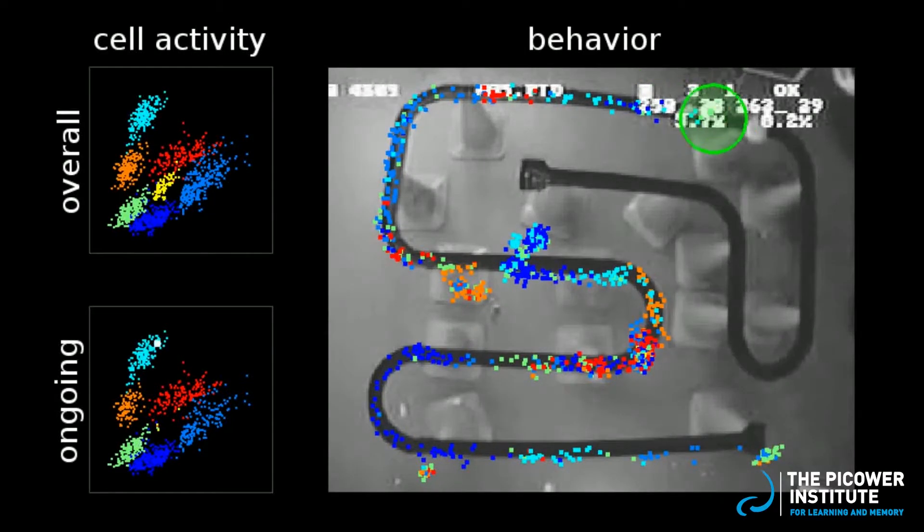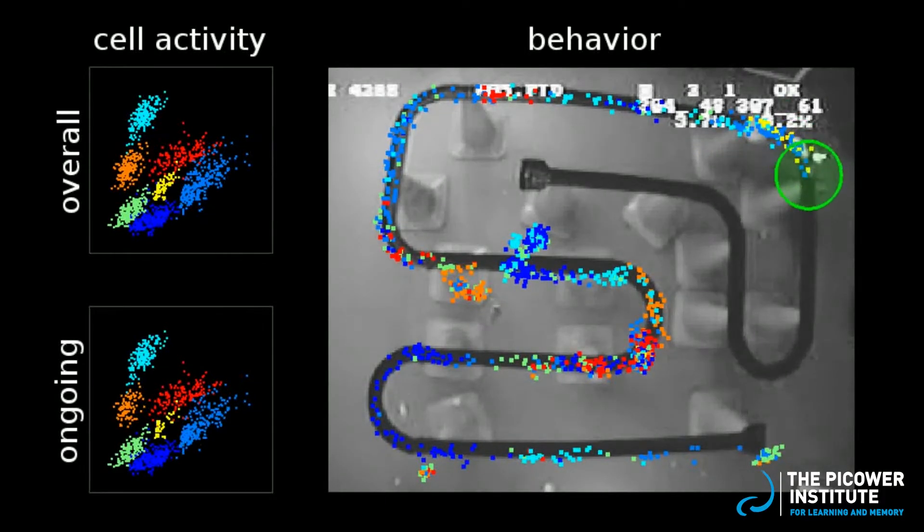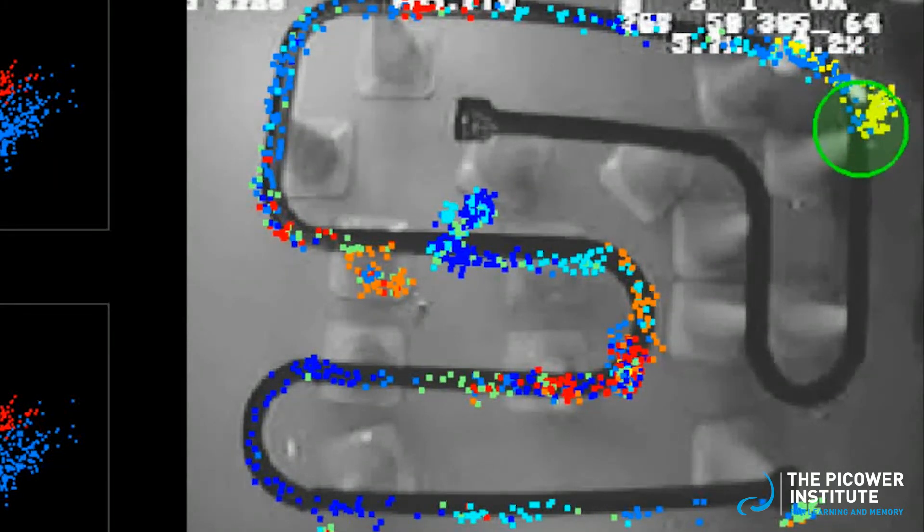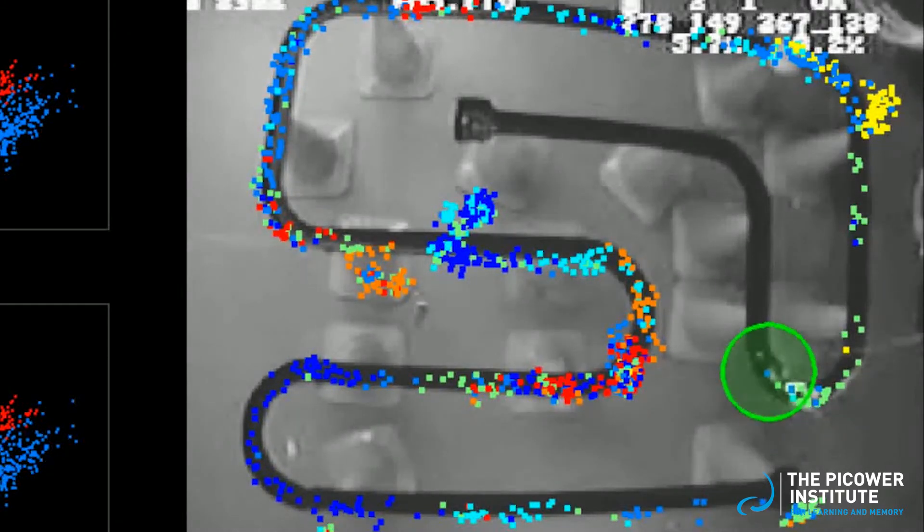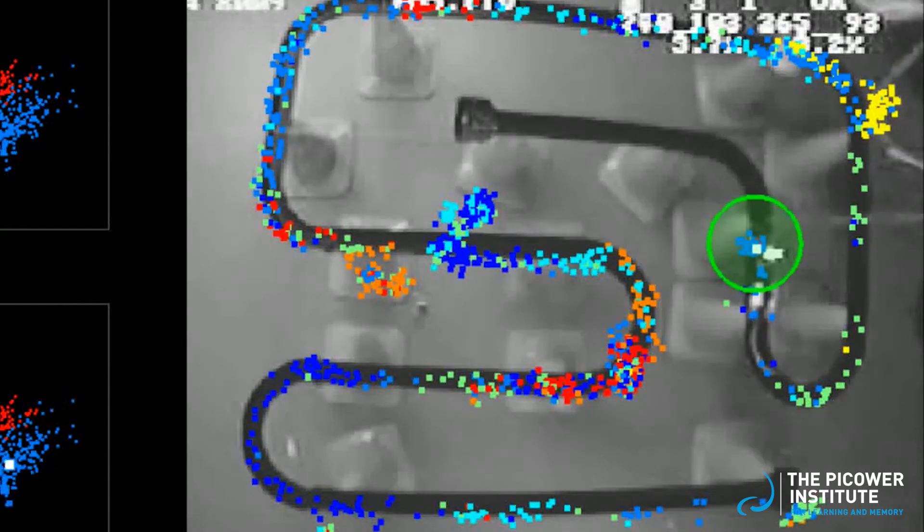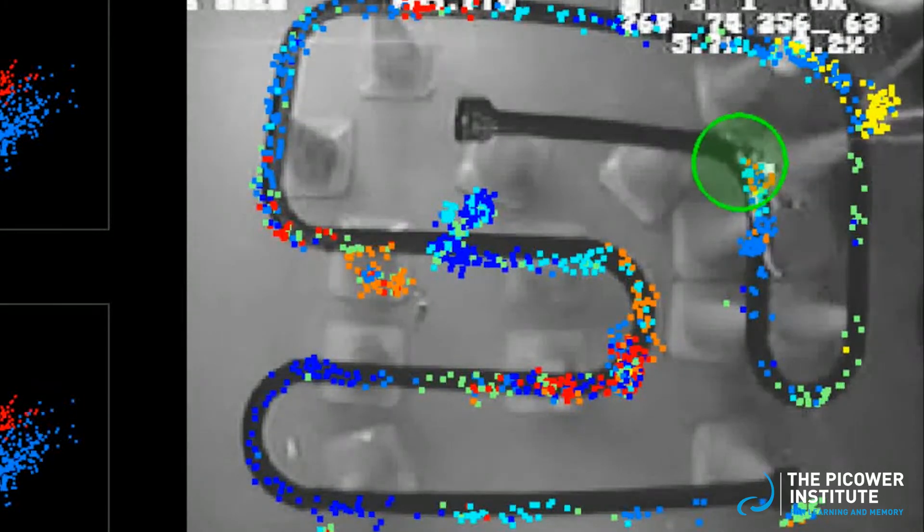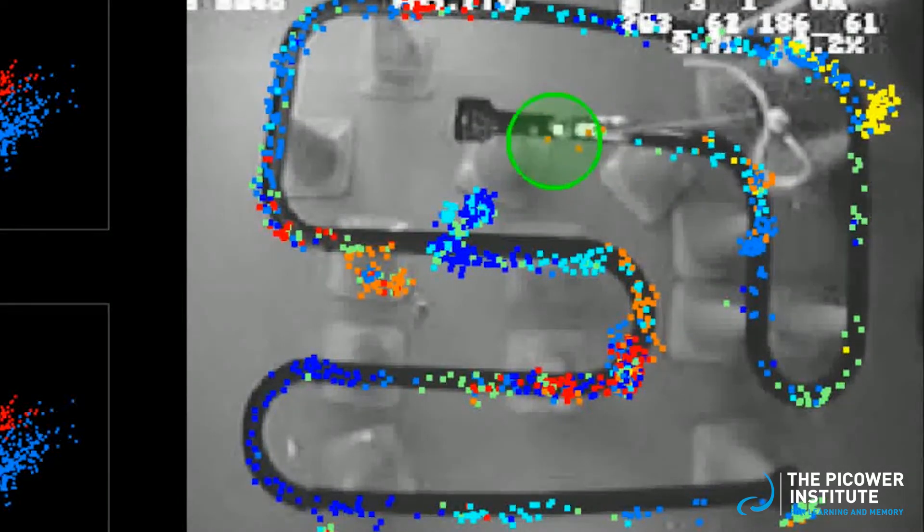By the end, you can see how the place cells are distributed across the track. Some cells, like the yellow cell in the top right corner, are very spatially precise and fire only when the rat is in that location. Other cells, like the orange cell, fire in clusters at a few locations on the track. The blue cells are less spatially precise, but still don't fire at every location.